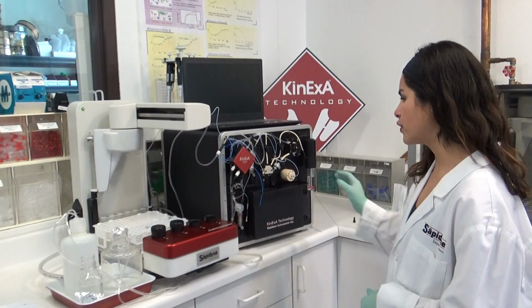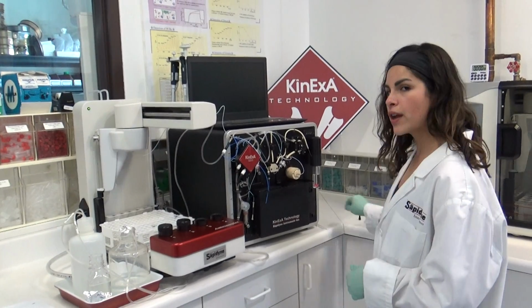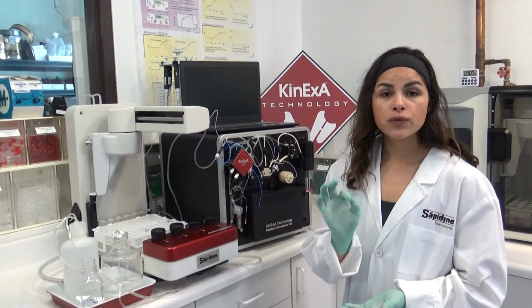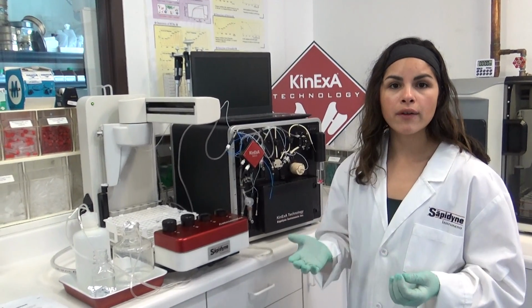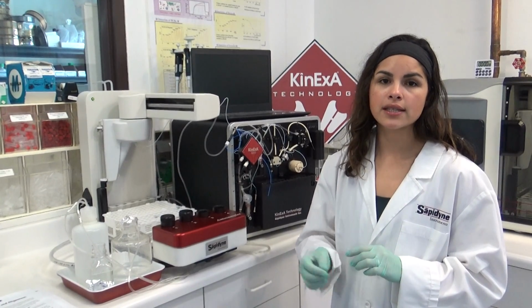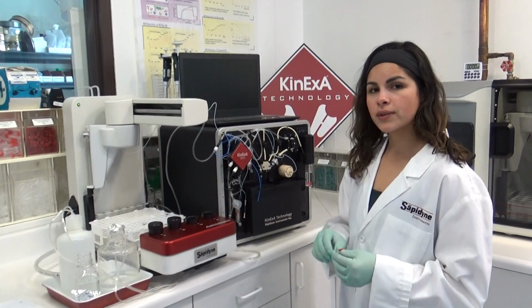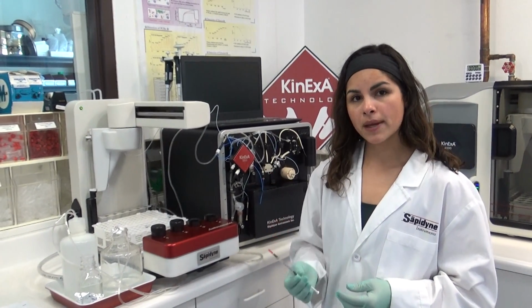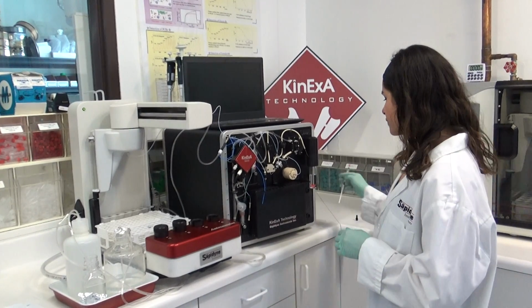You'll have to have your new flow cell that you'll be replacing, some additional ferrules. Each flow cell should have brand new ferrules with it. If you get a flow cell or if you have older flow cells without additional ferrules, please contact us so that you can get some new ones before removing your old flow cell. You'll also need some dielectric grease or index matching fluid, as well as some chem wipes and denatured alcohol.